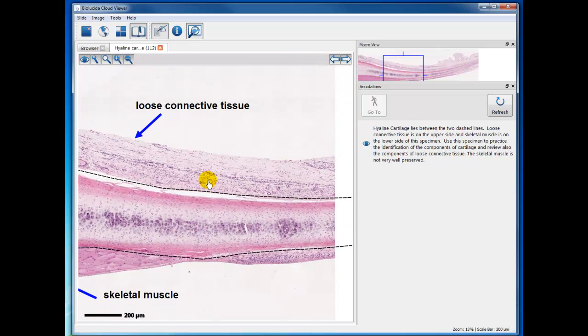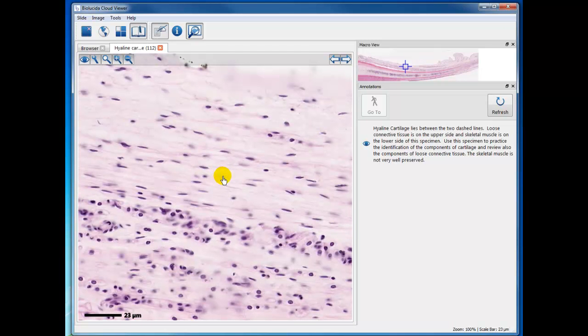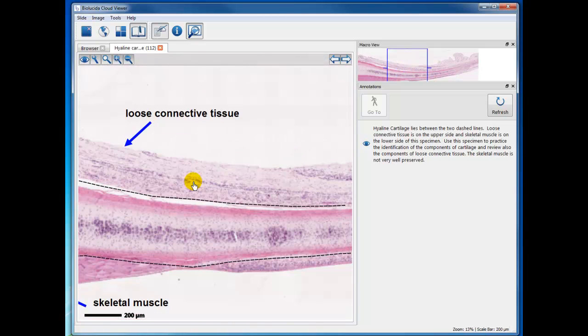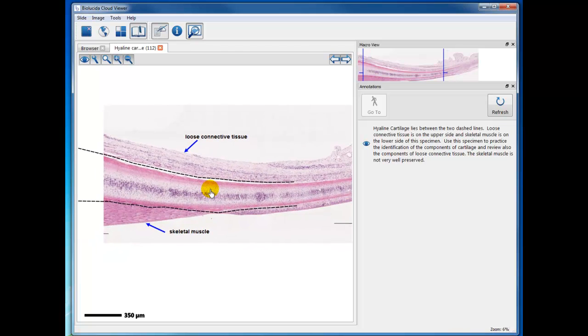So other features here are connective tissue. On the edge you have some collagen that's stained, and you see the fibroblast nuclei are lined up along it. Anytime you see rounded nuclei isolated in connective tissue, you can suspect that these are lymphocytes. And so that's the take-home message there. So just practice that. And that's about a 2 to 3 minute video.